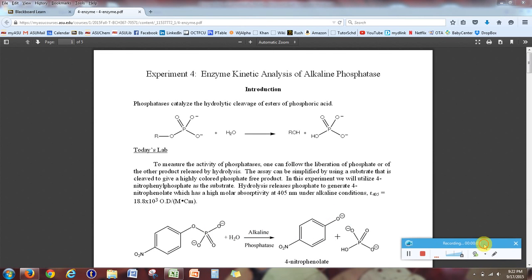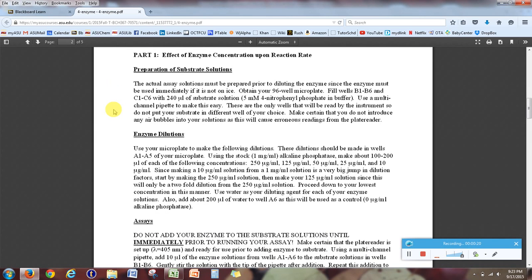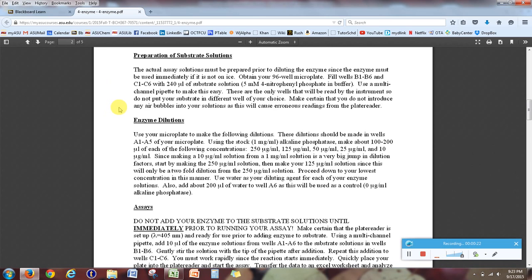So this is going to be essentially a video on how to use Excel, specifically for the Enzyme Kinetics lab that you're working on. Now this first video is just going to be focusing on your data analysis for week 1. And just a couple things that I'd like to point out from the protocol before we get started.